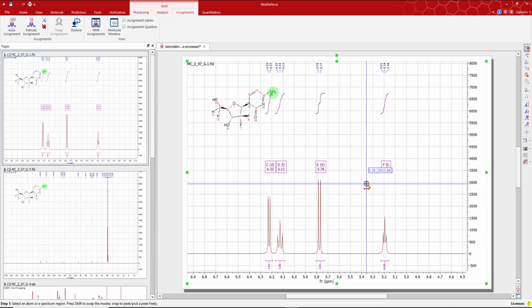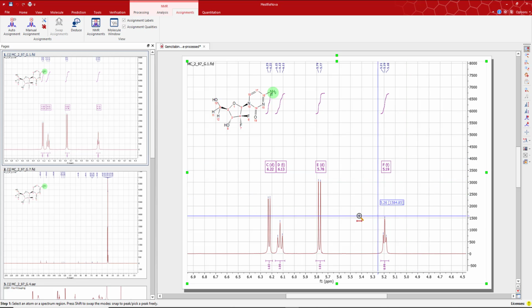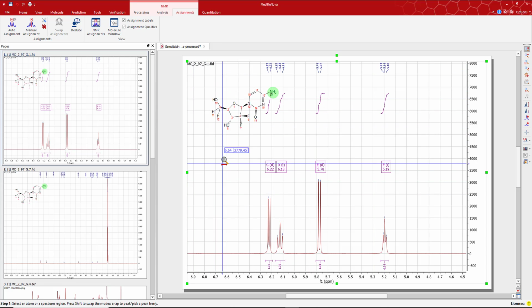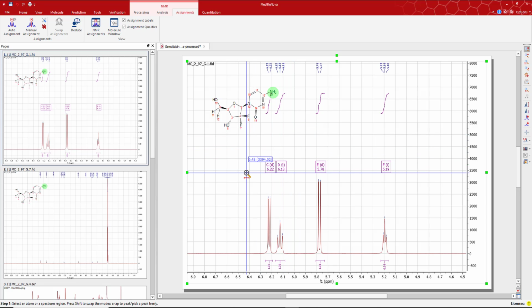So that means that since we see the coupling, we can already fairly confidently assign which of these is which. So a triplet here would be my OH with two neighbors, likely that one. The doublet here would be my OH with one neighbor, likely this one, number 8. That's probably the case, but just to be sure, I'm going to verify that confidently by using what I mentioned was the other good handle into this molecule, which was the diastereotopic protons here.